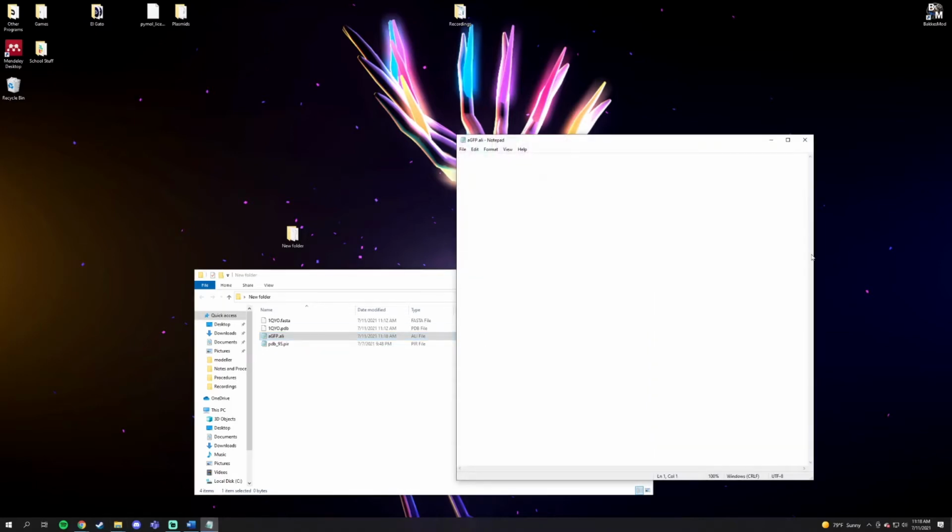Then we want to open up this notepad, and you will want to copy what I paste in here. Anywhere that has your protein name, we want to change it to AGFP or whatever your protein name is. So I will do that here, AGFP.